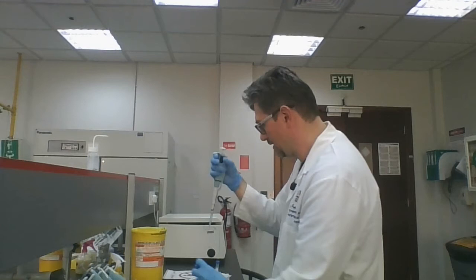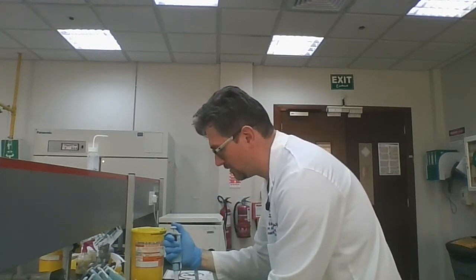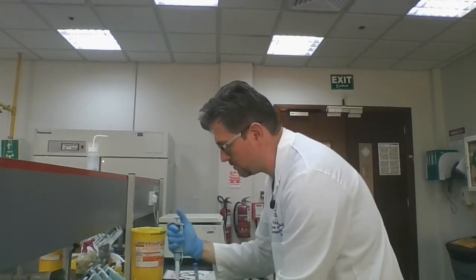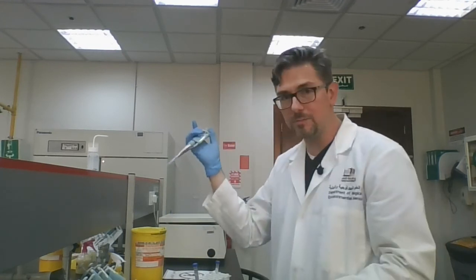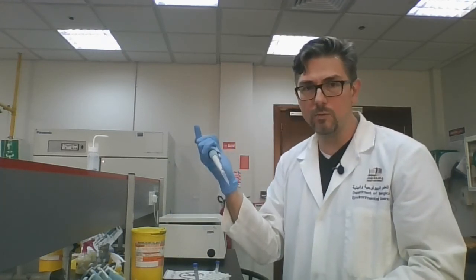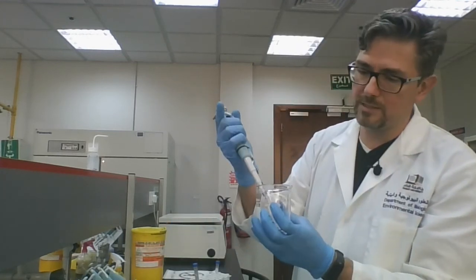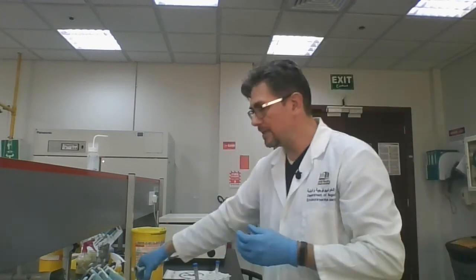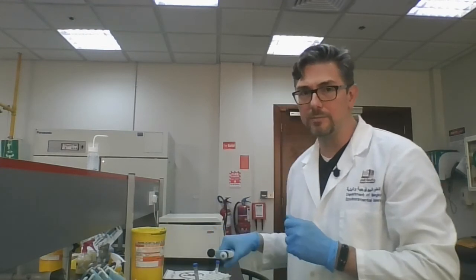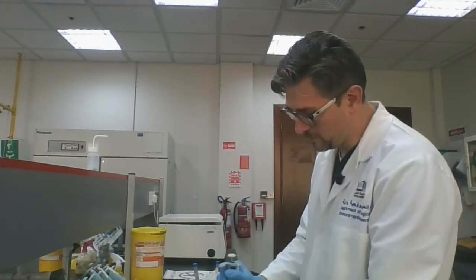Now I've got to work quickly. Oh, it's dripping already. I have my tubes open, so I don't have to wait to transfer these. Okay, and so these tips, these are phenol contaminated. They go into the organic waste containers. So I have a beaker on here for organic waste. I'm going to place this tip in here. So anything that has phenol in it is going to go into that beaker and it's going to be disposed of properly. Okay. So again, I'm going to do the other tube now, trying to work a little bit quicker this time around maybe.